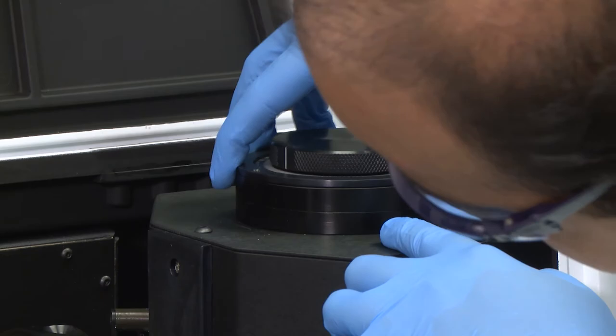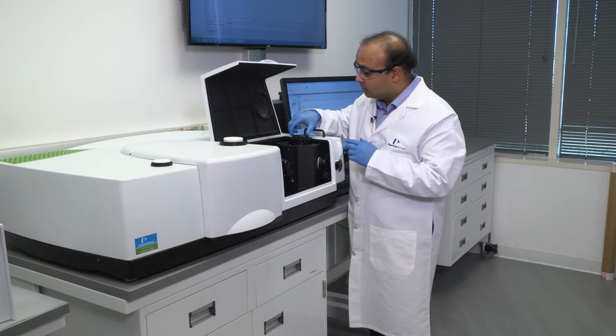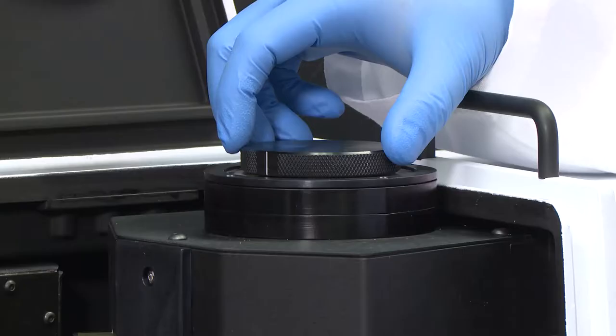There are a couple of nuts here that will help lock it in place right there. There is a goniometer mounted on top of the sphere here, or on top of the accessory here, that will allow us to make positive or negative measurements, angular measurements, as we dial the knob one way or the other.